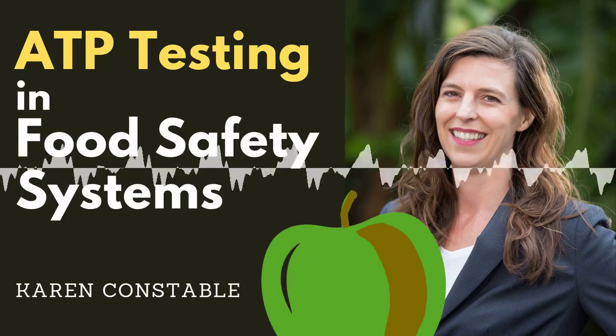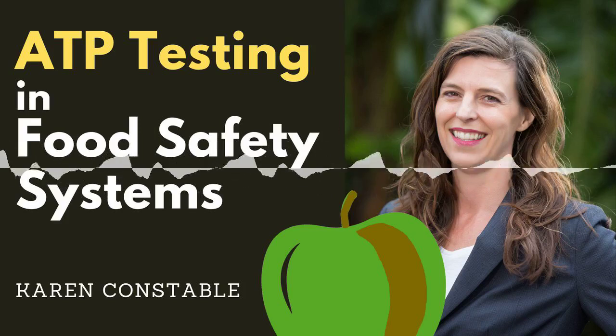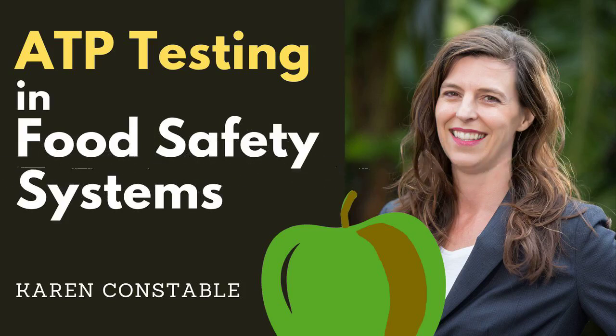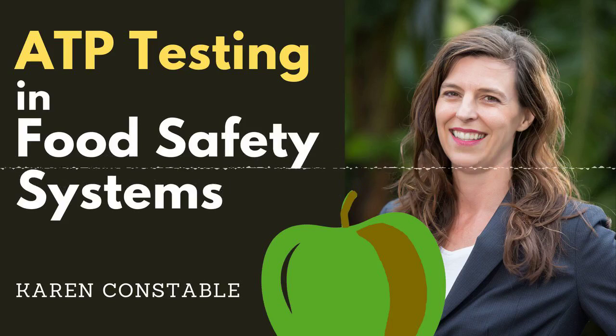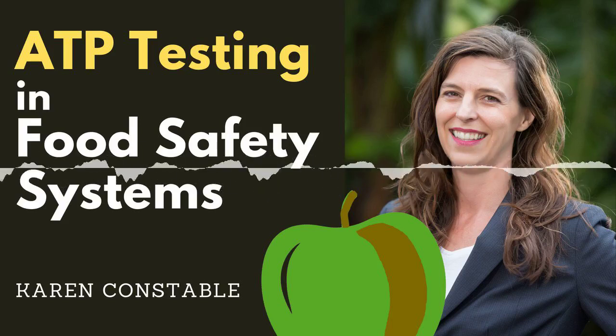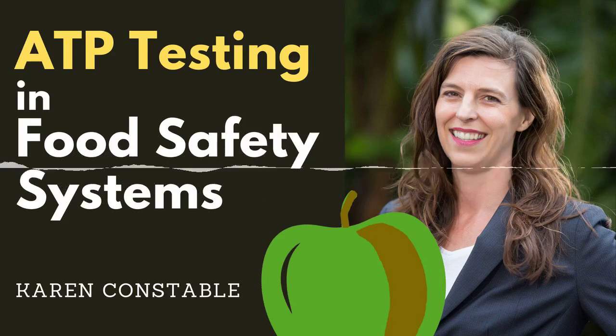Indirect food contact areas such as parts of machines adjacent to food streams. Hard to clean areas such as nozzles, grooves, joints and O-rings. And environmental areas such as walls, floors and drains. And in the email and the post, I've got an infographic that shows how the RLU readings get smaller as you clean a surface for 3 different food types.